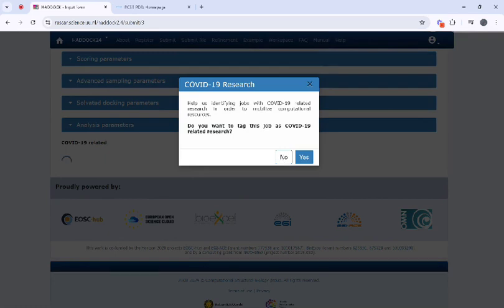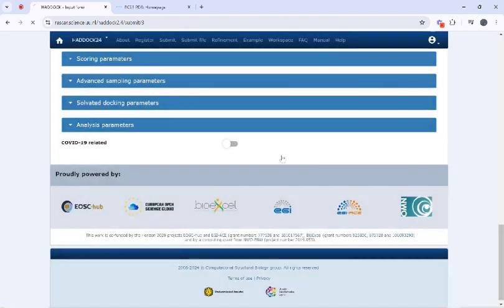Here if you want to tag this job as COVID research you can, but I will not, so I will click on no.